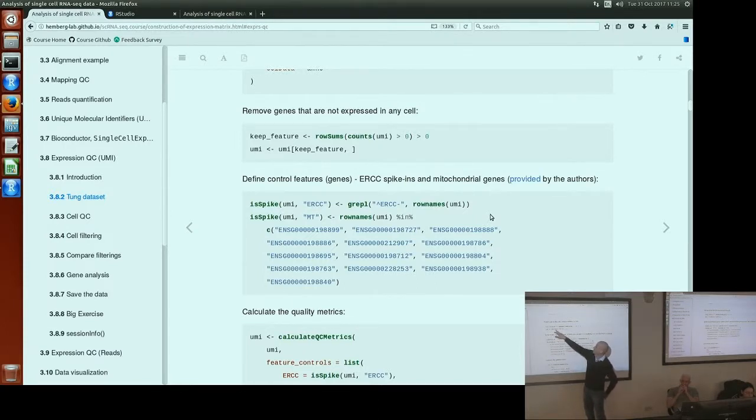So we say we want to remove the genes. We want to only keep the genes which satisfy this criteria, and this will subset the genes and also subset the annotation for the genes, but we don't have annotation for the genes. But in your own experiment, when you have it, everything will be done automatically here, so you don't need to worry about separately subsetting your matrix and annotation.